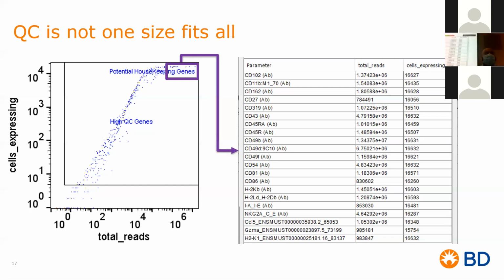This is something you actually need to go in there and do yourself. The technology is not quite there yet, or at least not in Seurat, to do this automatically, and I have not seen this in other software either. So this is a point of concern and contention that I would highly advise you to look into with your multiomic data, or just your RNA-seq data, period, before running it through any pipeline like Seurat, or doing analysis yourself.